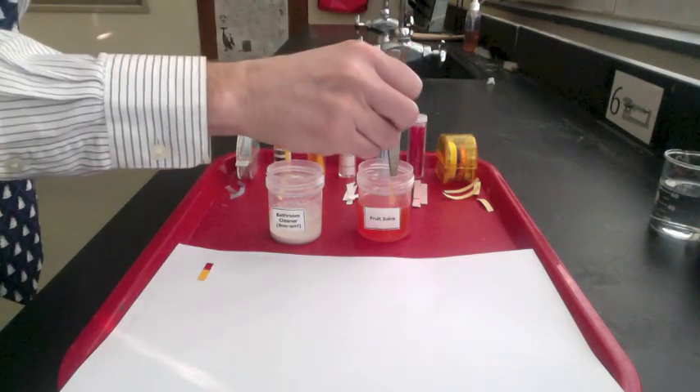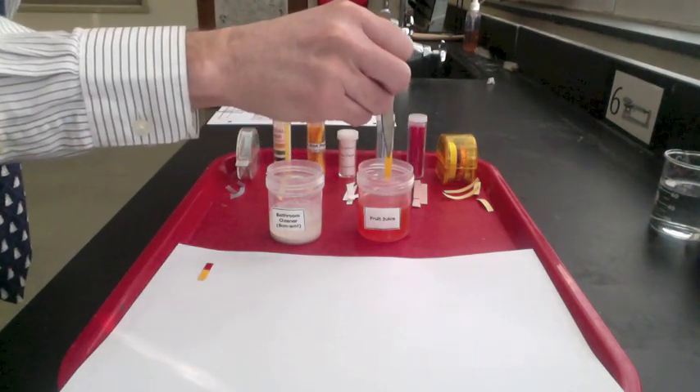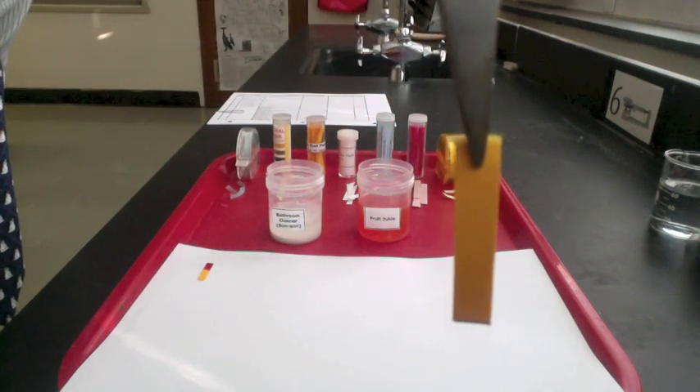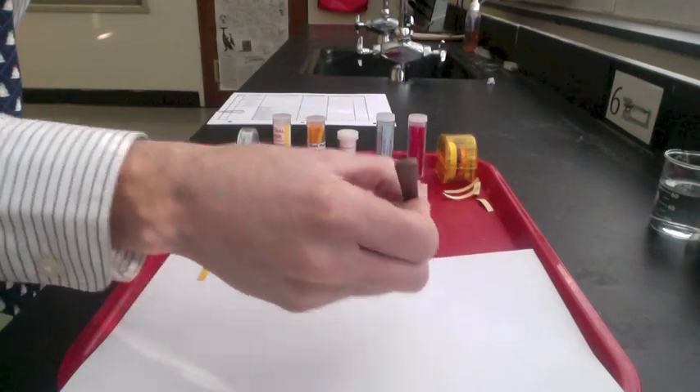Now we'll put goldenrod paper into the fruit juice. It's still gold, which means the fruit juice is either neutral or acidic.